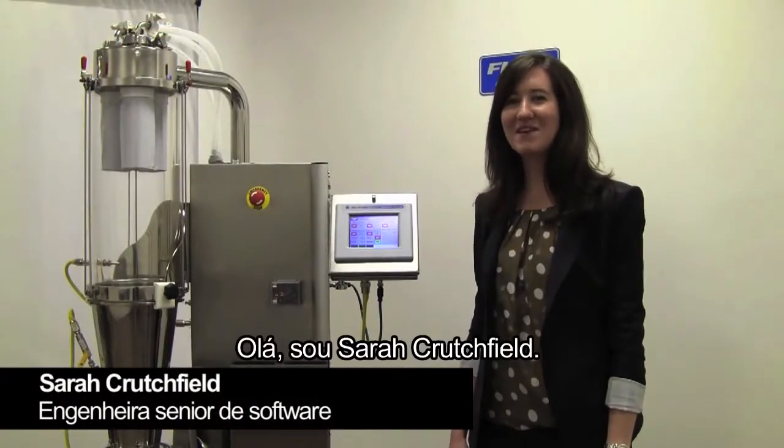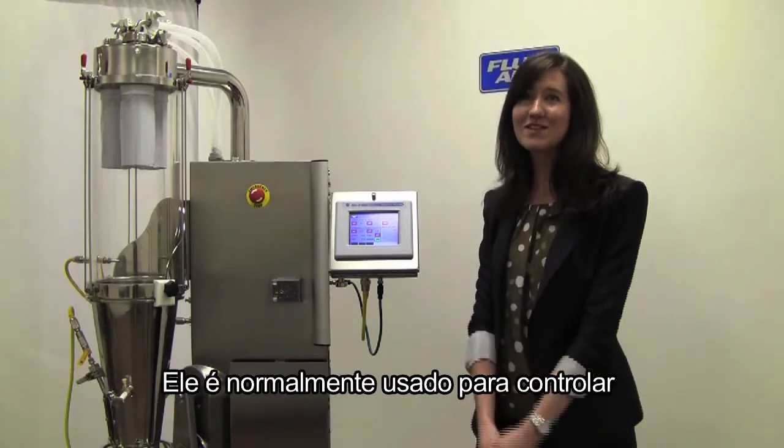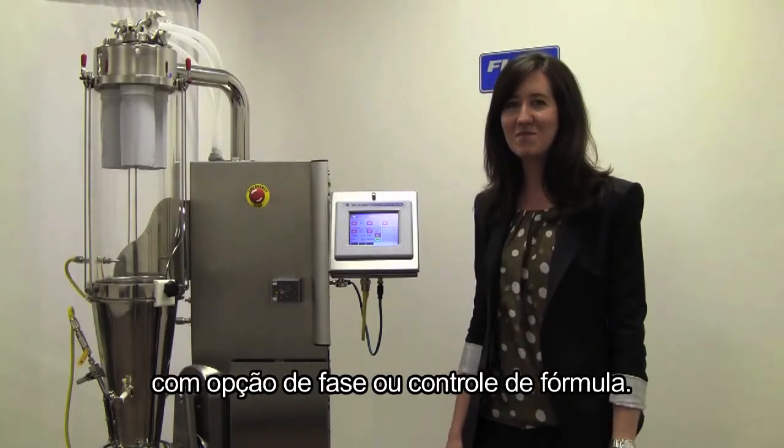I'm Sarah Crutchfield. I'm here to talk about Fluid Air's Batch Architect control system. It's typically used to control Fluid Air lab scale equipment. It can be operated manually or with optional phase or recipe control.